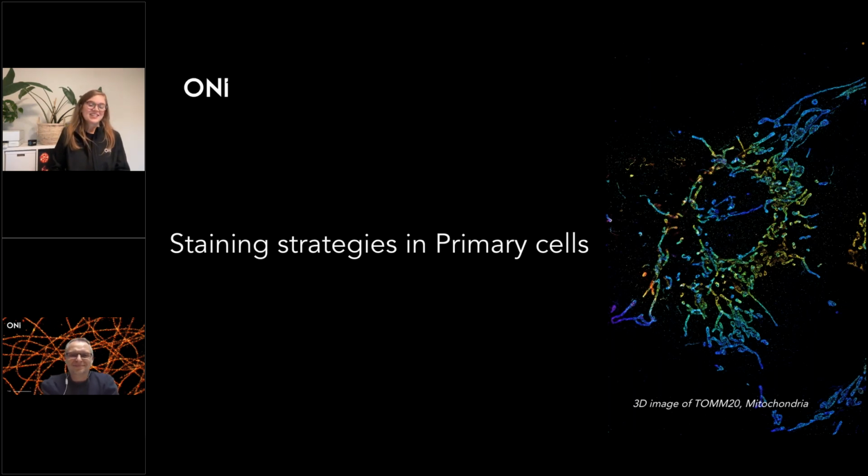So, yeah, thank you. Darian from the audience actually has a low abundant protein, or low abundant molecule, he's working with, and is asking, how do I minimize the background noise then? I can imagine probably with primary and secondary, yes, you will most likely have a little bit more background noise. How do we minimize that?